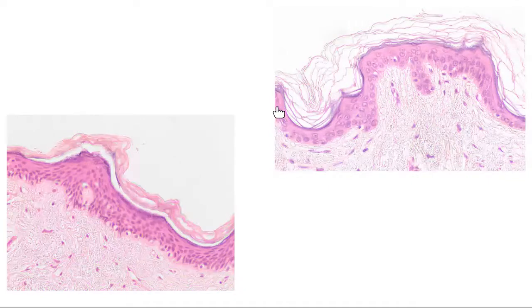Yeah, so Kate is pointing out that we can really see in these pictures that these cells are keratinized, totally. See all these little wavy things that kind of look like hairs up here? These are cells that are so full of keratin and so completely dead and flat that they're just kind of shedding all the time. Remember we talked about how this is what the dust is in your house. It's all of these flat cells that are so skinny. Back in a former life, in a better day, they looked kind of like this, round and plump. And the farther they got away, as they grew and got pushed out, they became these flat, skinny, full of keratin things that we see here.